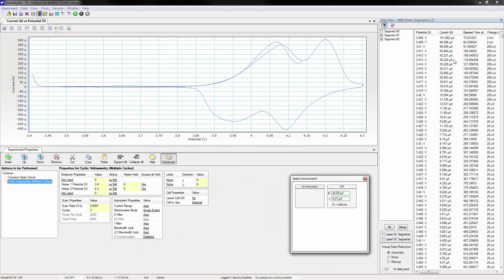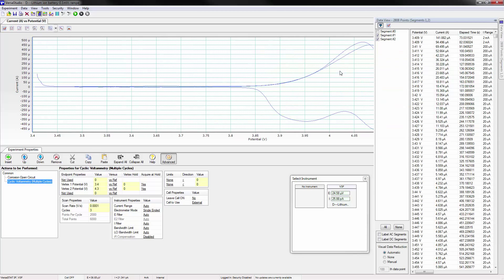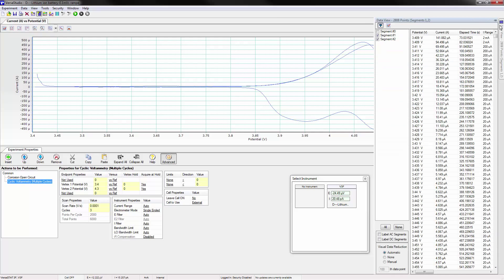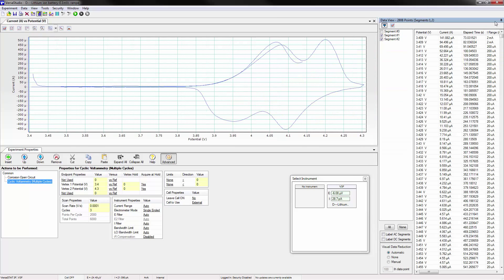The data view window can also be unpinned, placing it in the same auto-hide format. It too can be resized and moved once it has been pinned in place again.